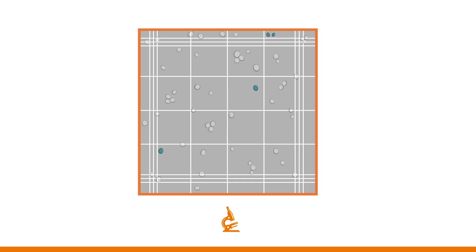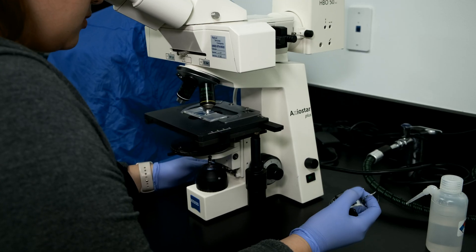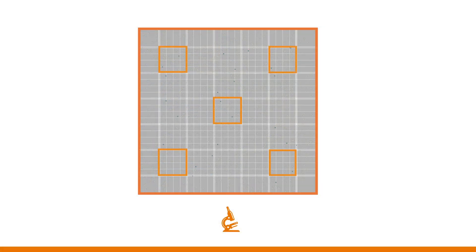At 40x, focus on a single square of the 5 by 5 grid and you will now be able to count the individual cells. You will perform counts on 5 of the 25 squares using a handheld counter. We recommend the 4 corners and the middle square.